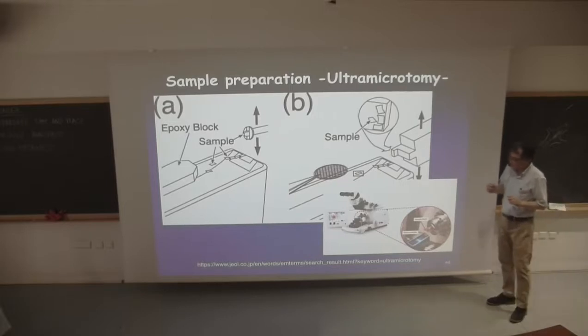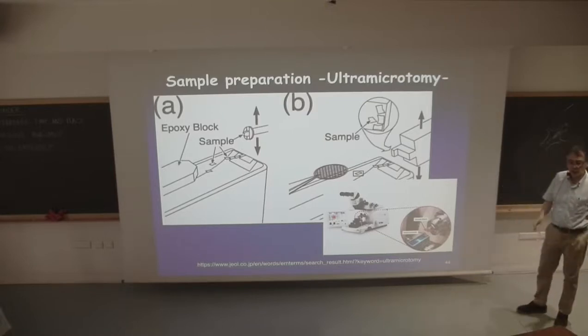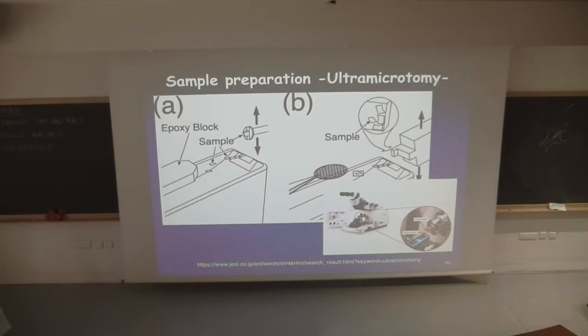Anyway, for a soft one, what you can do is cool down the sample. Imagine cheese: at room temperature it can be soft, but at low temperature it can be a little harder, right? Then you can cut it. That's called cryomicrotoming. Or you can change the knife speed. It's a viscoelastic property, right? Lowering the temperature and cutting with a fast knife have a similar effect. So the first choice is changing the temperature, and to optimize the result, you may want to change the knife speed. That's how it works.